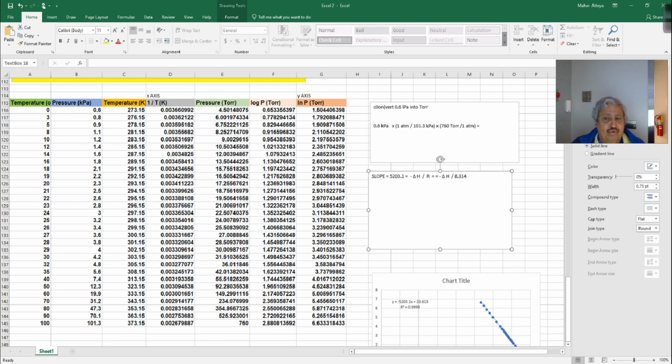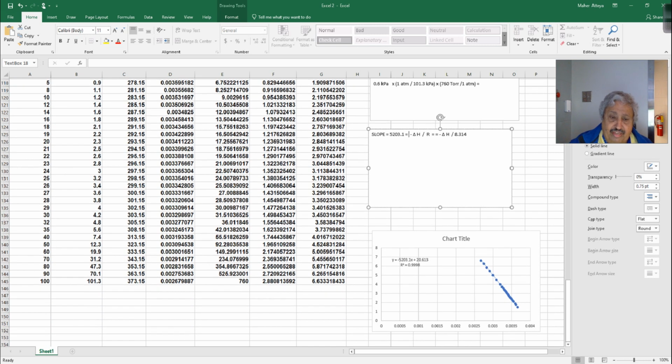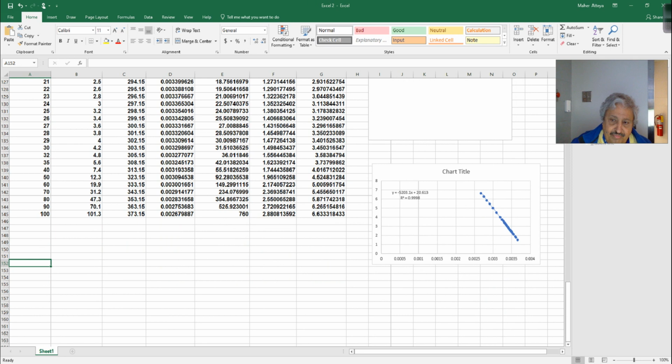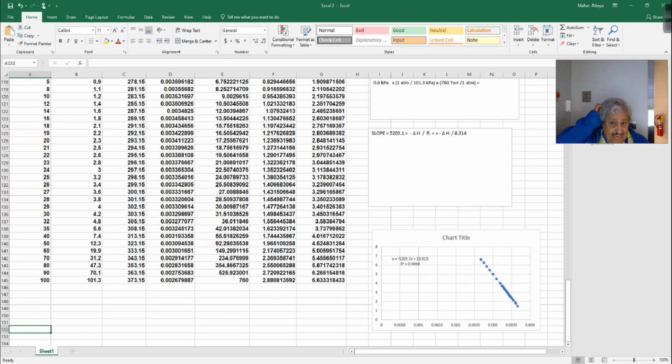Okay guys, can we make a formula out of this? Yes or no? Yes, we can. We can determine the delta H of this reaction. Let's do it together. So here I'll make a small tiny setup. Sorry about this. Okay, so let's make a formula here. Let's look at how we do the formula.